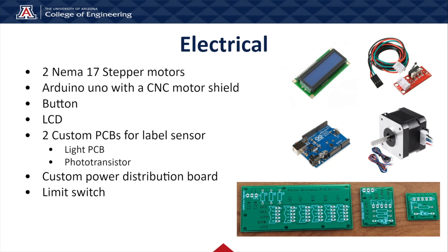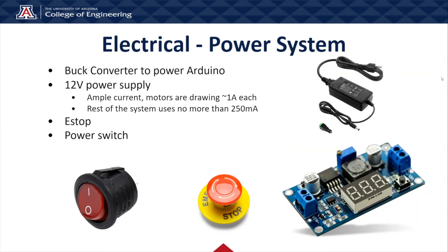As for our electrical system, we have two stepper motors and an Arduino Uno with a CNC shield to run them. We have a button, an LCD, and two custom PCBs for the label sensors — one with a phototransistor and one with a light source. These are pointed directly at each other, so when the phototransistor is unable to receive light from the light source, we know a label is in position. We have a custom power distribution board providing 5V to multiple outputs. We also have a limit switch to detect when a slide is in the machine. Our power system uses a buck converter to downstep the 12V input to 5V for the Arduino. We have a 12V power supply, an e-stop button for emergencies such as label jams, and a standard power switch to turn the machine on and off.